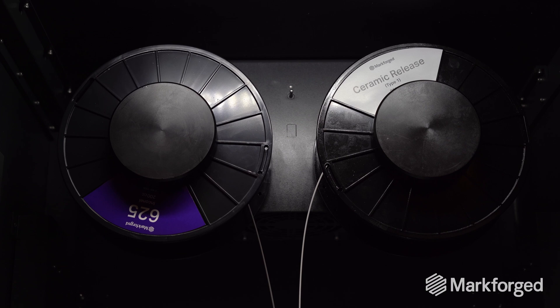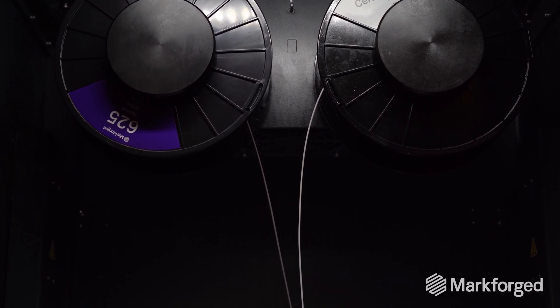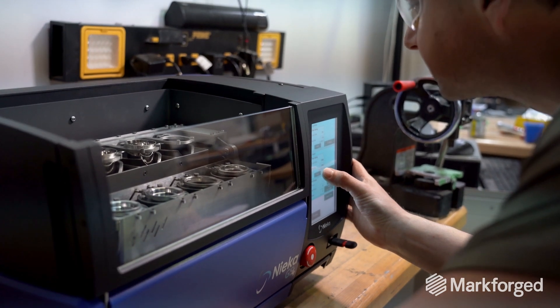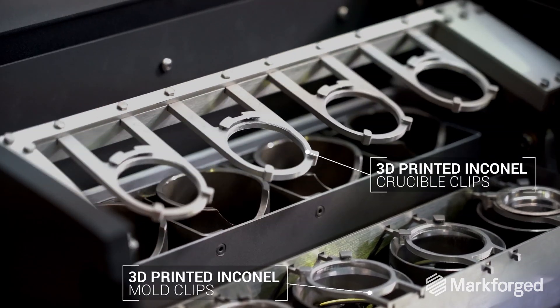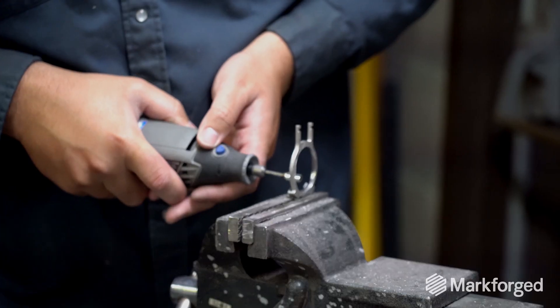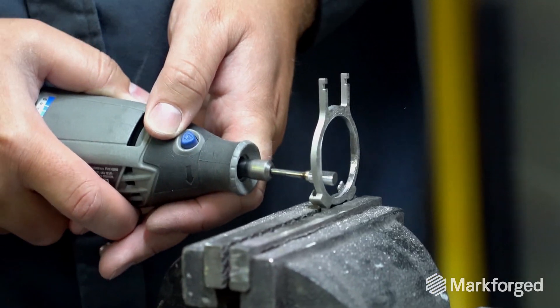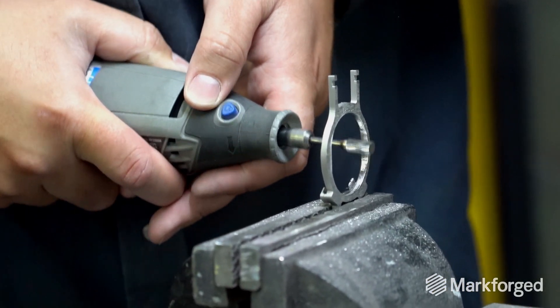Inconel is interesting because it can sustain very high temperatures and temperature cycling as well. One of the main applications for Inconel here at NECA is the crucible clips. Machining them was an option; however, the cost of machining Inconel with more complex features is extremely expensive, so we turned to 3D printing initially with DMLS.